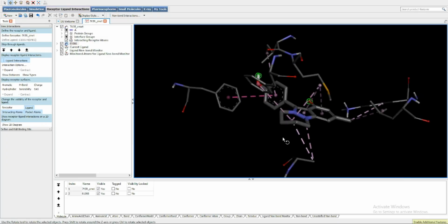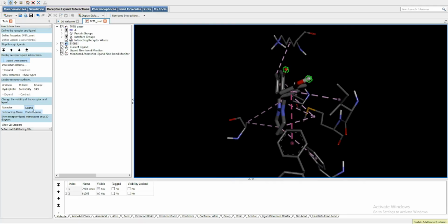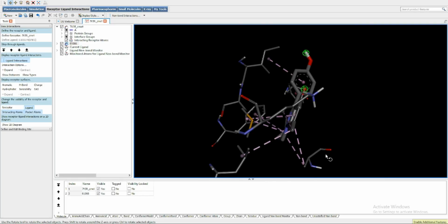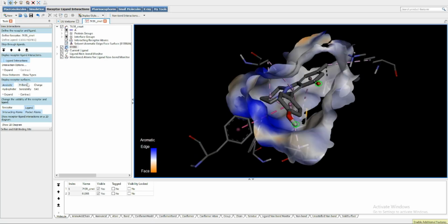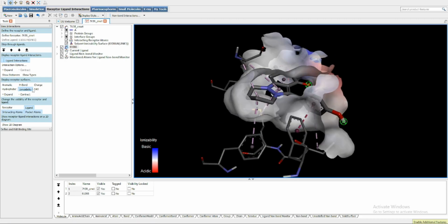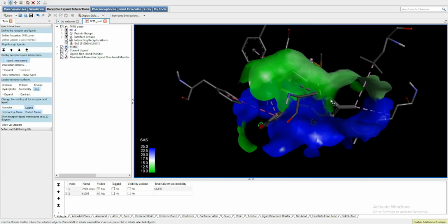Also you can check out all this from PYMOL also. I'll try to show you, but I think Discovery Studio is a little bit easier, but PYMOL actually gives you the better visualization. So both of them actually are pretty good. So this is the interaction. Here the bond, and you can check every single interaction over here, and you can check out the bonds actually, atomic bonds, and hydrogen bonds, charges, everything you can check out from here. This is pretty easy. Hydrophobic bond, ionizability, SAS, and a lot more. Okay, so this is the visualization of your ligand protein interaction from Discovery Studio.